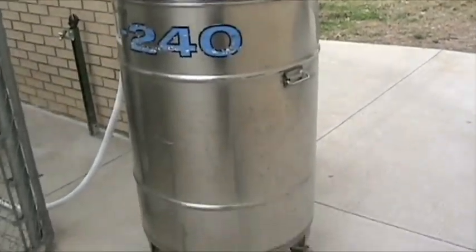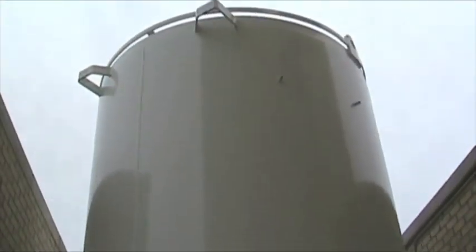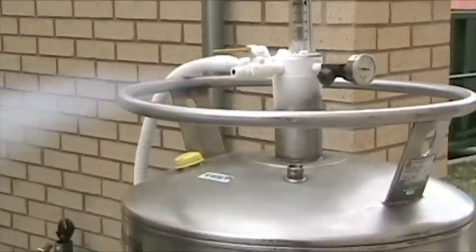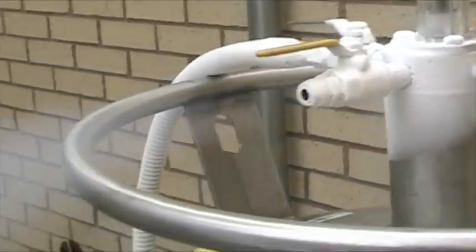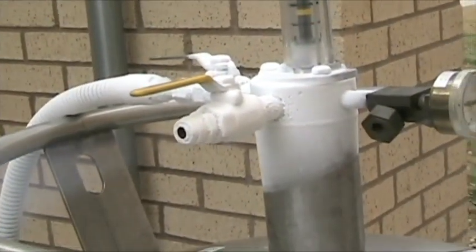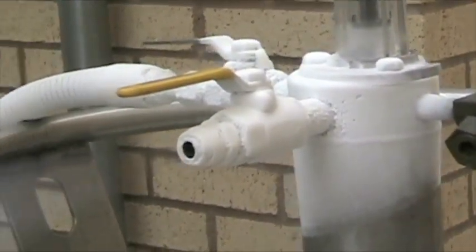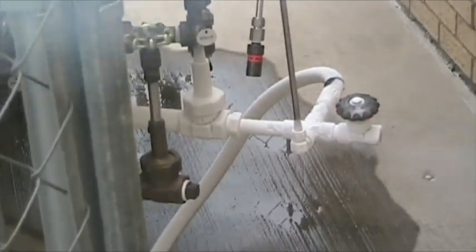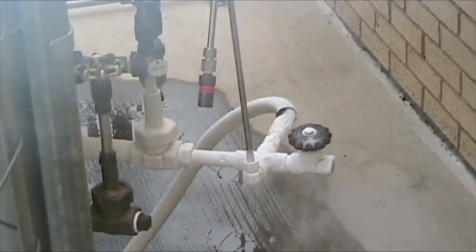So what kind of dewar do we use to fill that up? Well, we use this dewar — this big huge giant dewar. I'm back against the building and I can't back up any further, but this big huge giant dewar fills up that via this port right there. It goes in to the top and cold gas spews out. This is nitrogen gas that has evaporated — it's very cold. As you can see, the whole thing turns into a big giant block of ice, and in fact when it's very very humid, this whole entire assembly will turn into one big huge chunk of ice. So that's how we do it.